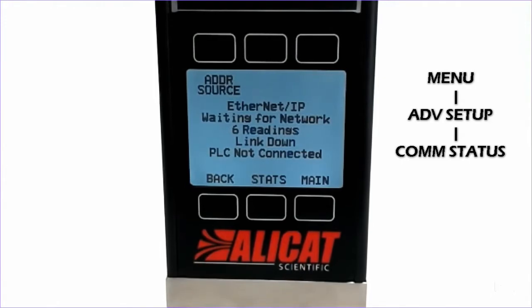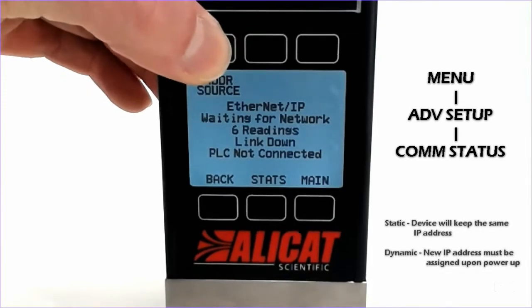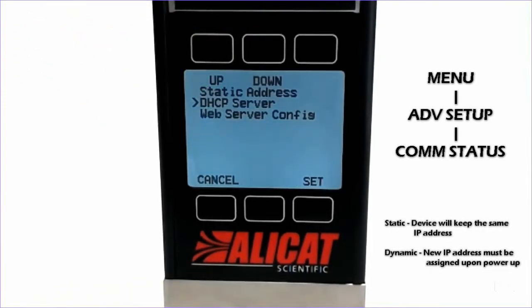We see it is configured for EtherNet/IP and it is currently waiting for the network as it has not been connected to a PLC or computer. We can still adjust the address source at the top here. We see we have three sources: a static address, DHCP server, as well as web server configuration.